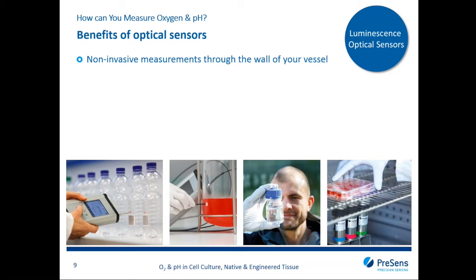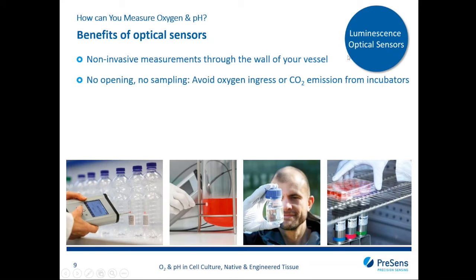That means we use light for signal transduction, and light can penetrate through transparent walls, such as plastic devices or glassware, and you can detect the signals from the outside with the detectors. Thereby, you do not need to open your sample or do sampling while making a measurement. Therefore, you can also avoid oxygen ingress or CO2 emission from the incubators, so your growth conditions stay stable during the measurement.